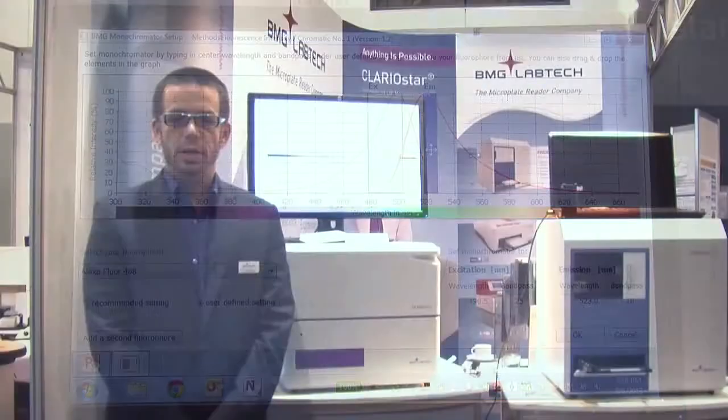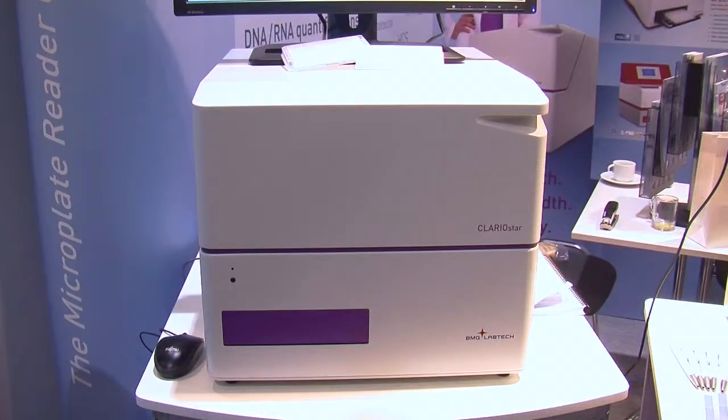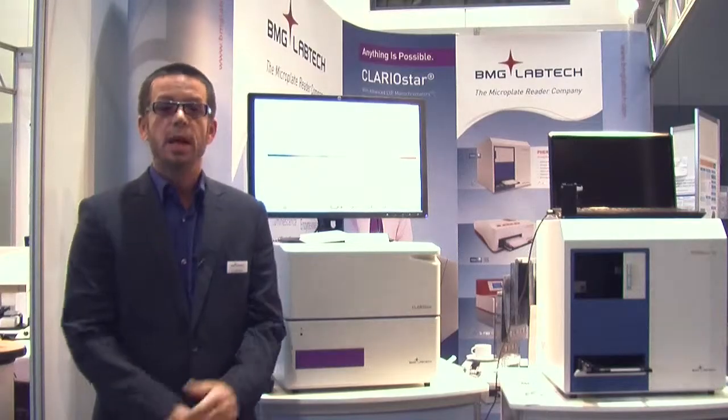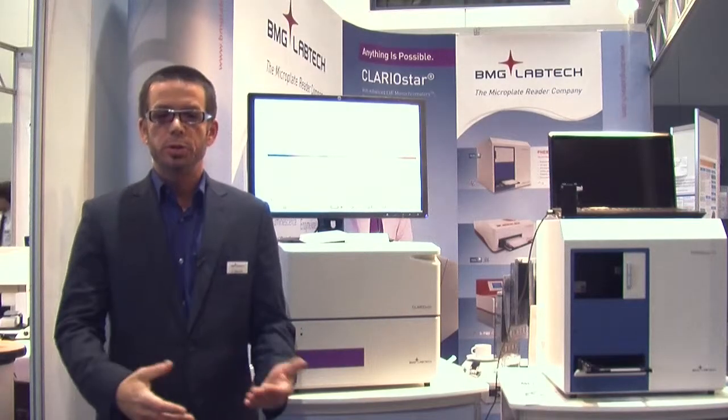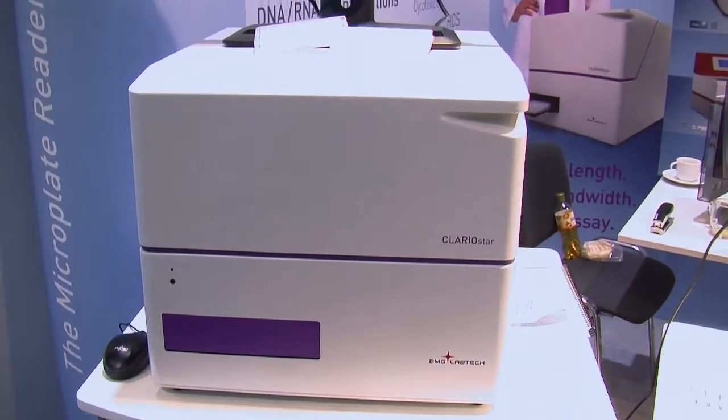The benefit of the Clary Star for customers is that it will not make you compromise between different detection modes. A lot of plate readers on the market can do many assays, but many can't do all of them. Having these different technologies in one microplate reader allows you to do every possible assay on one platform. The customer doesn't have to have multiple instruments for multiple applications — with the Clary Star, you have a multi-functional, modular reader that does it all.